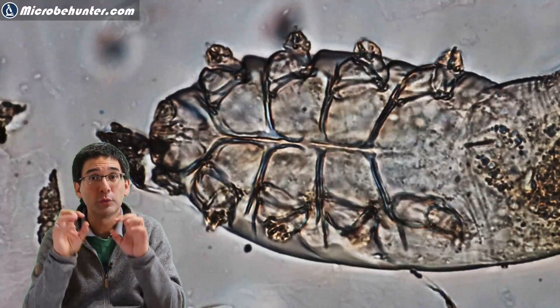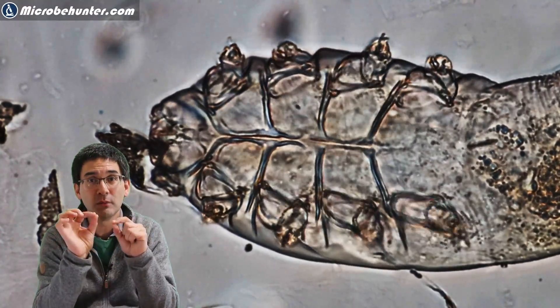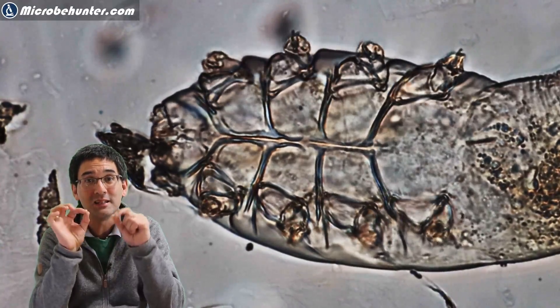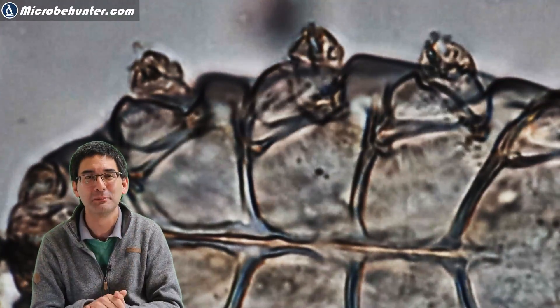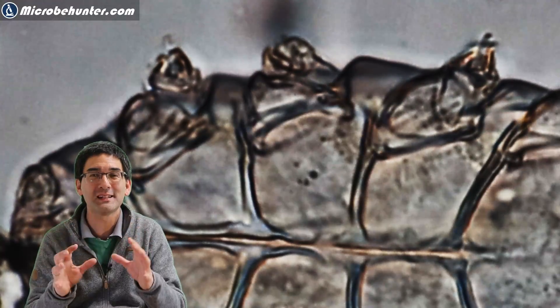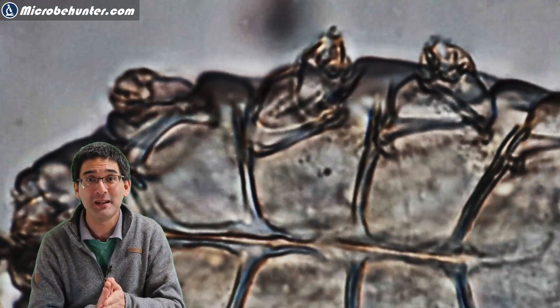I think it's also fascinating to see, if you zoom in a little bit, what's going on inside the little animal. Sometimes you can also see some of the movement inside the body — some of the organs — which is very fascinating. I really zoomed in a lot so the image is a little bit blurry, but the movement of the legs and also the organs is really interesting to see.